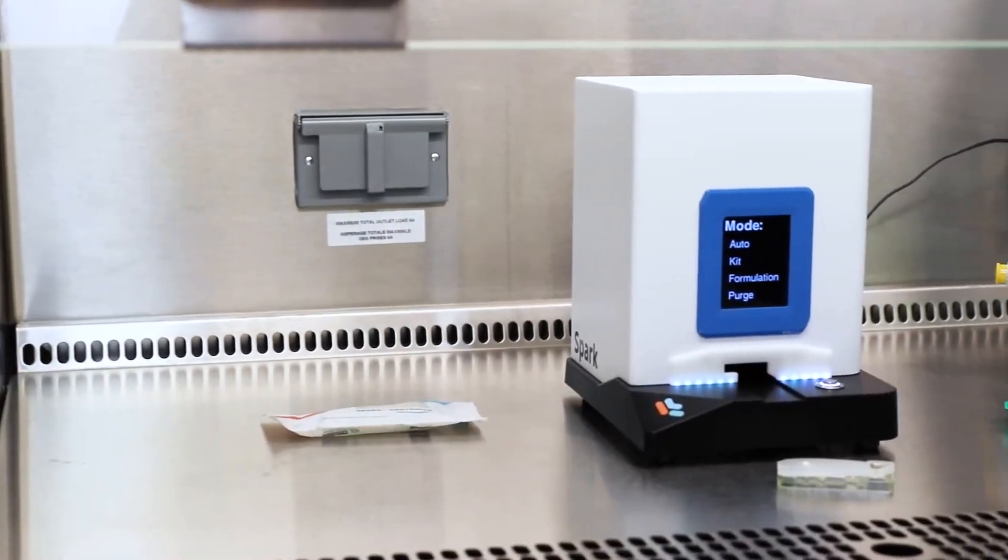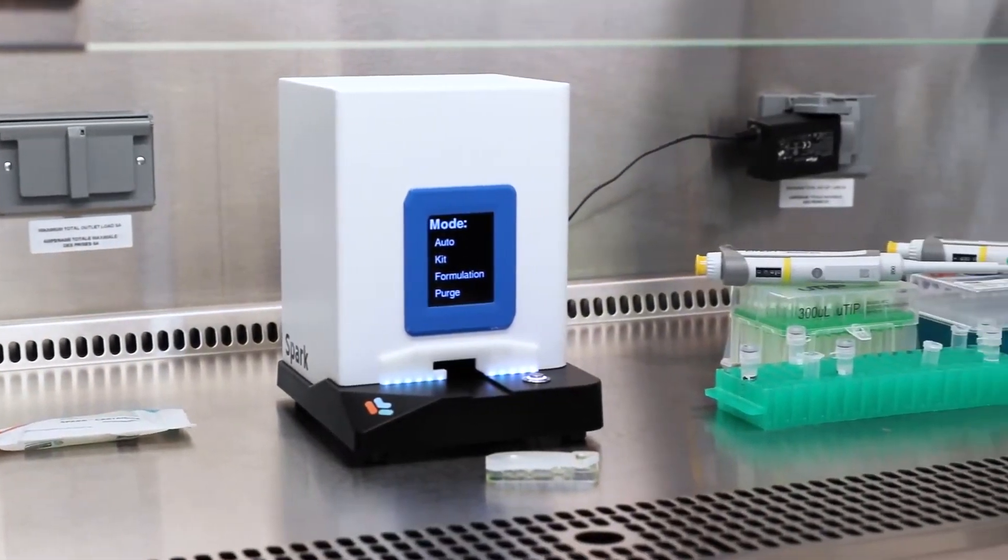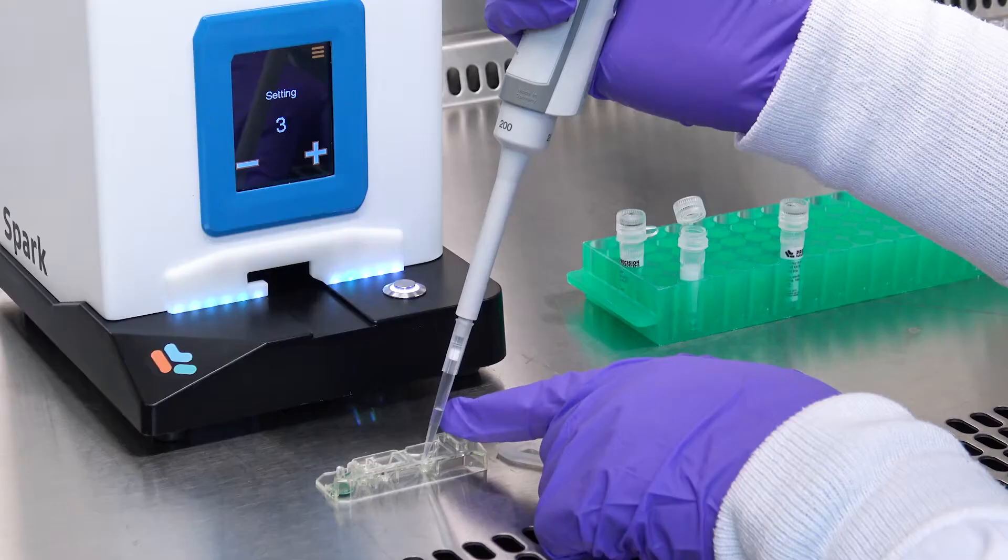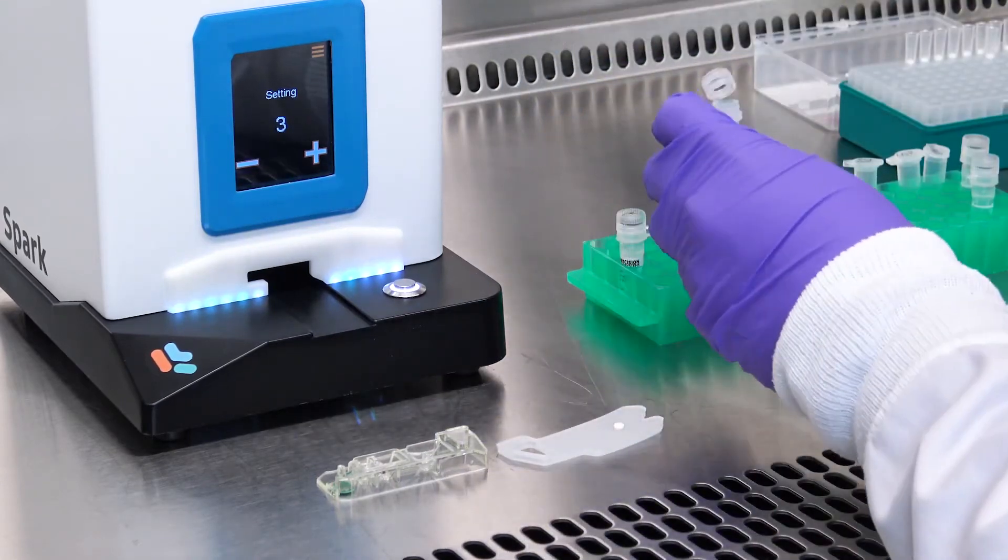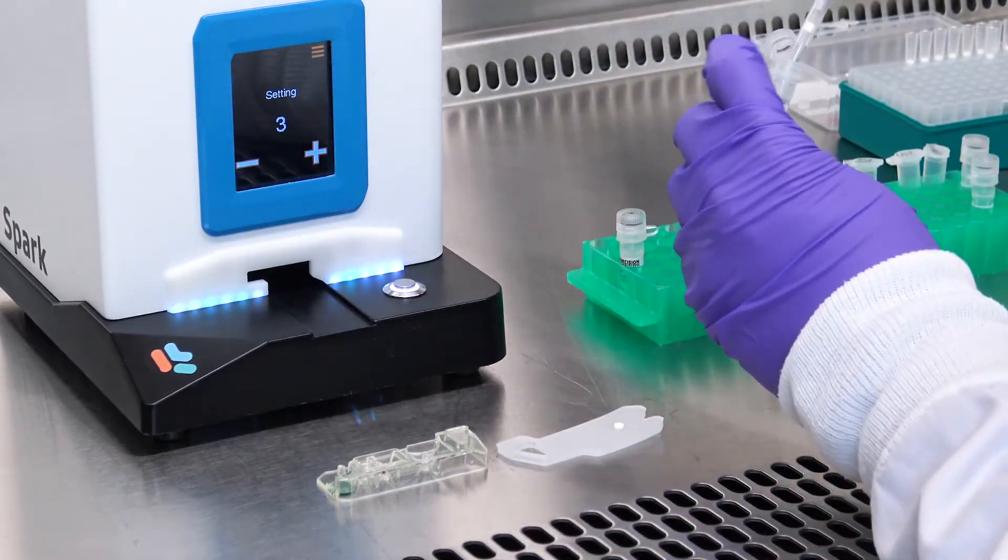The NanoAssembler Spark is ideal for discovery and early preclinical development of RNA lipid nanoparticles, enabling rapid microliter formulations to conserve limited or expensive ingredients with minimal waste.